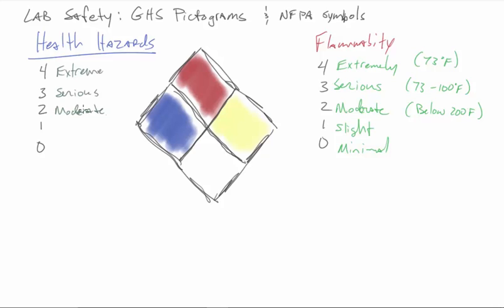Generally, with that, you're going to try and avoid exposure with your hands and your skin as well. Number 1, this is slight. And so breathing apparatus may be worn. And again, we're going to protect ourselves against probably some skin conditions. We're trying to keep or reduce exposure on our skin. And then for 0, this is minimal, no precautions necessary, which means you can probably eat it if you wanted, but we're not going to eat anything in chemistry.